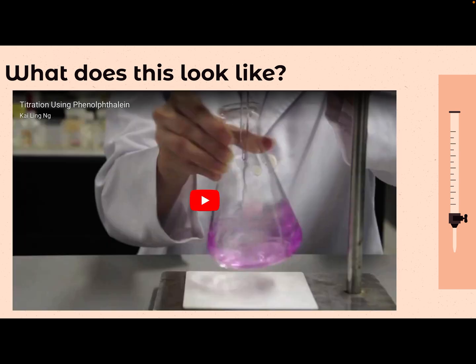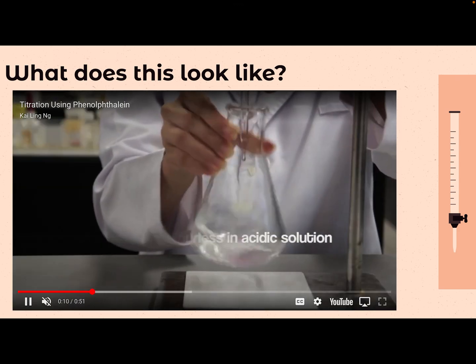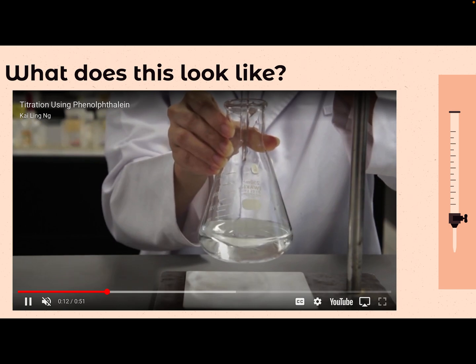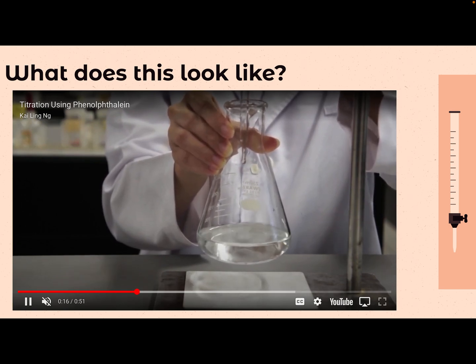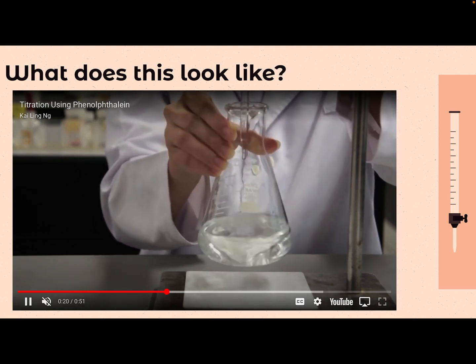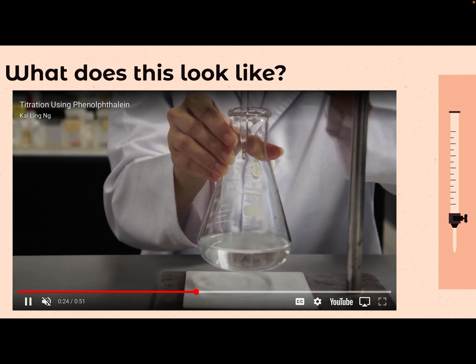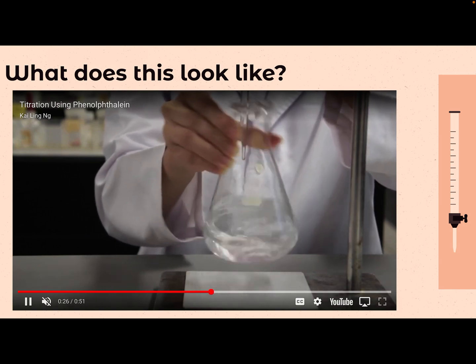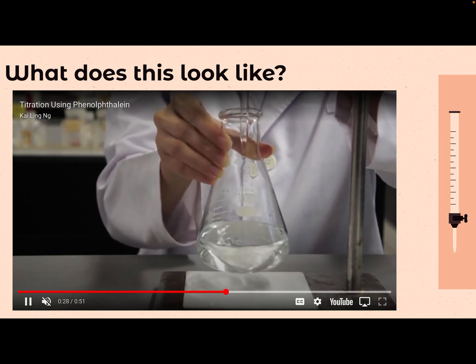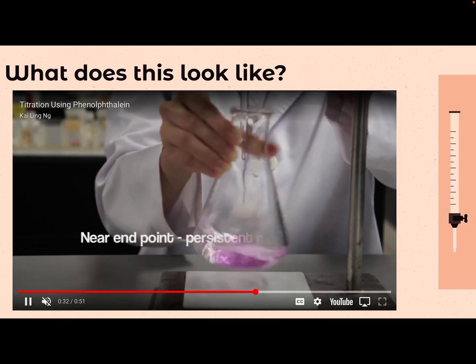So this is someone performing a titration. You can see that the reaction flask is starting as colorless, which means that's acid in there. Our acid is the analyte. And as she's adding those little drops of the base, you see that pink color start to flash. The pink is interacting with the base, showing that it's starting to neutralize, right? But it's going back away because overall the solution is mostly acidic.